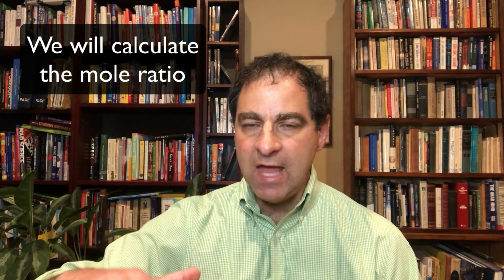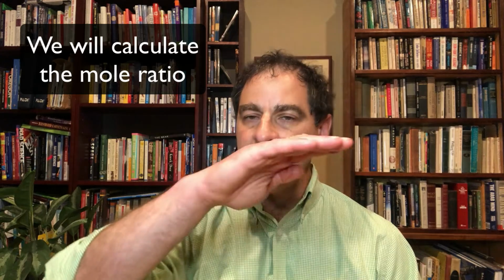We can find its dry mass after it's anhydrous, find the moles of aluminum potassium sulfate. We can then figure out the difference between the anhydrous form and the starting form, how much water went away when we heated it. That is our mass of water. We can find out how many moles of water there are then. So now we know the moles of alum, anhydrous, and we know the water. We can make a ratio of the water to the anhydrous alum to find out how many moles of water are for each mole of aluminum potassium sulfate or the alum. That's the goal of the second part of the lab.